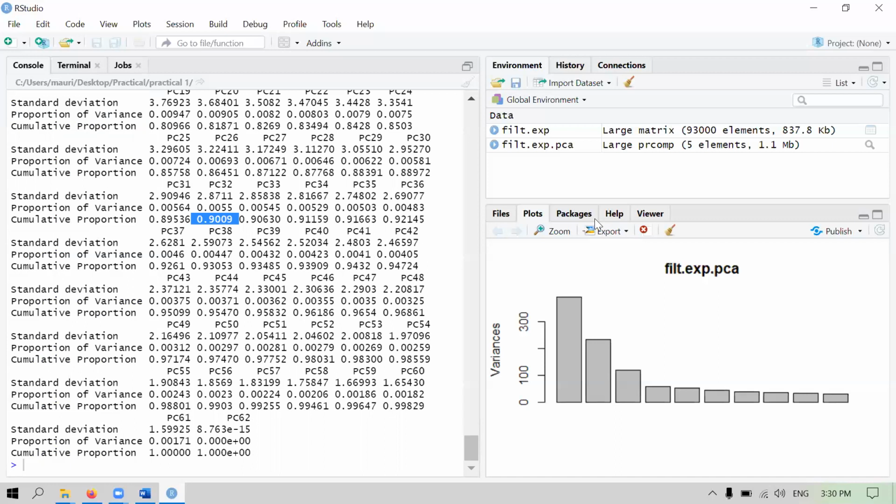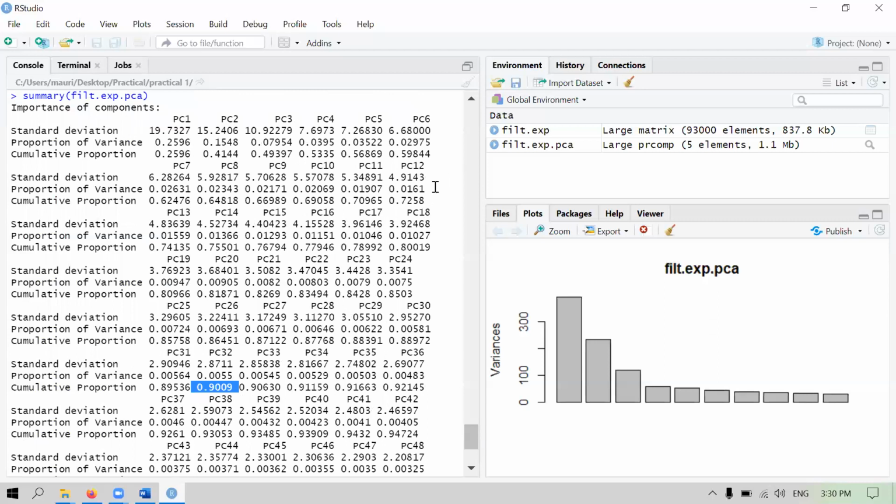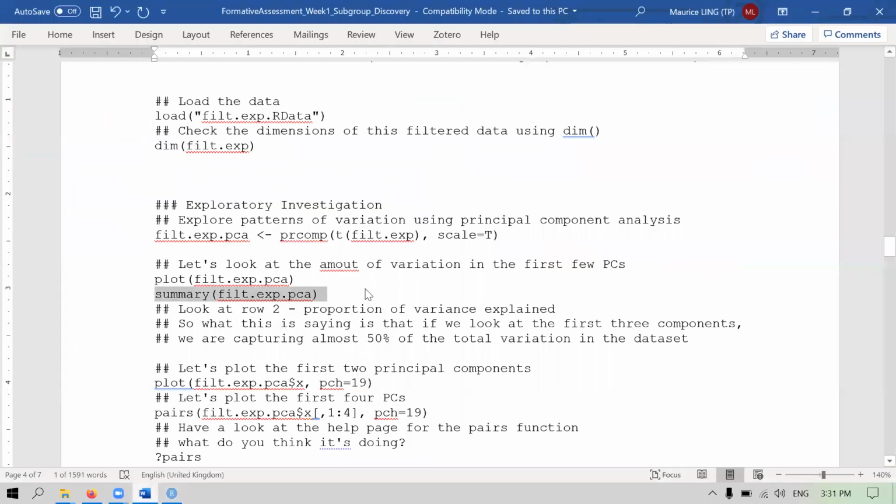But who wants to deal with 15,000 probes? You may just want to deal with, let's say, if I only have finances to study 11 probes, maybe that is a good panel of genes to account for about 71% of all the variations. So this is what principal components does. It tells us what the level of variation we have is. The worst you can see is when the first principal component is so weak. Then you need many principal components to account for all the variations you want.